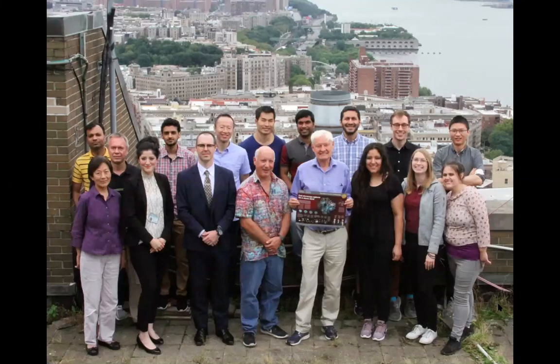And in my lab, people have to get sophisticated and look at different software, and they typically combine them in an ad hoc way and not on platforms. But I very much encourage using the existing platforms. And your Spider, now, you don't develop it anymore?